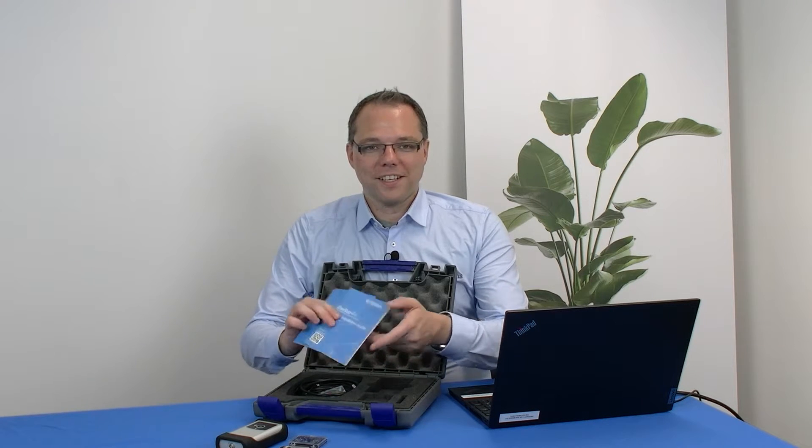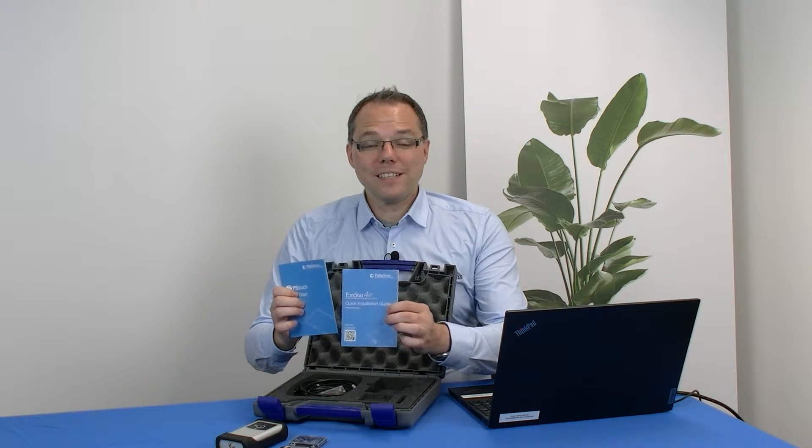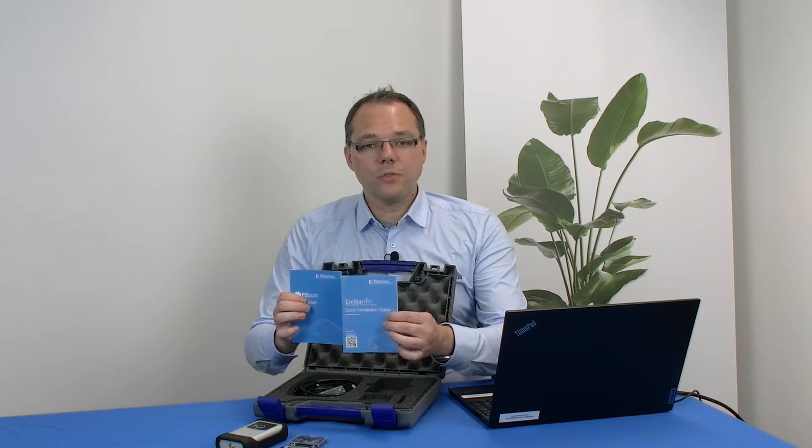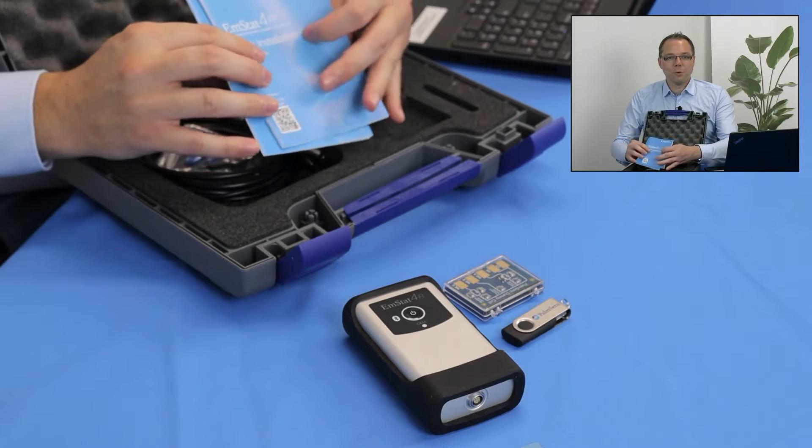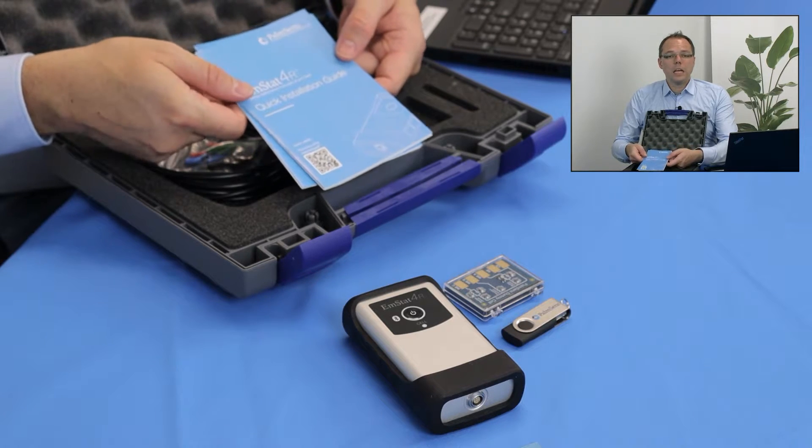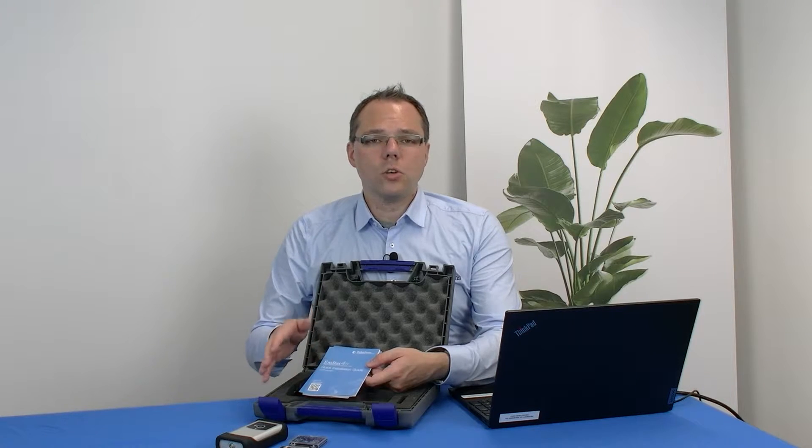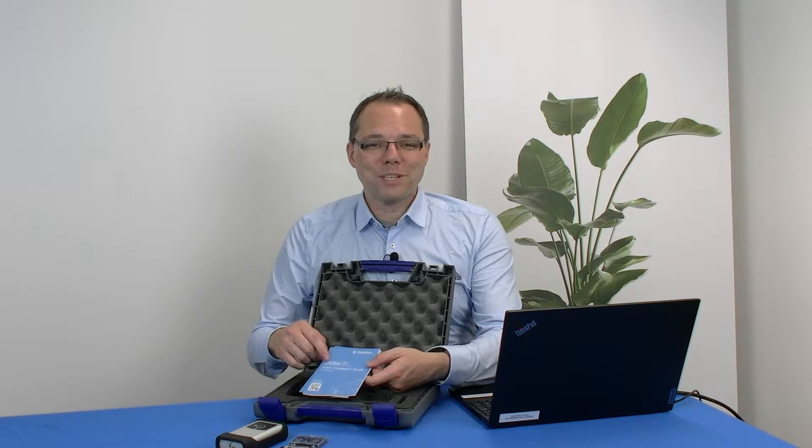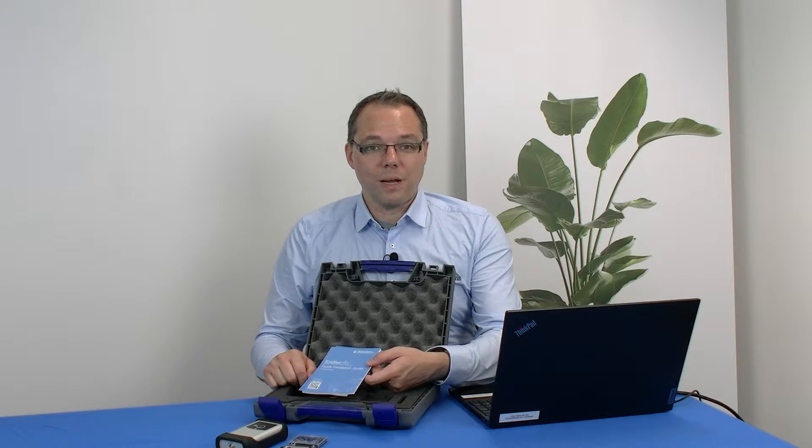Also you will find inside two quick starts that will make it easy for you to start your journey with exploring the Emstat 4R. If you don't want to read it, don't worry. We will do the first measurement that's described in here in this video as well.